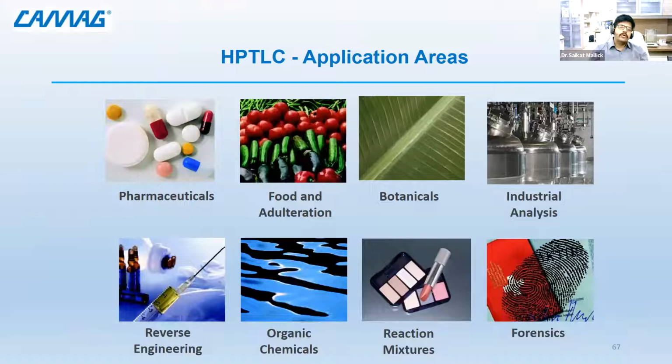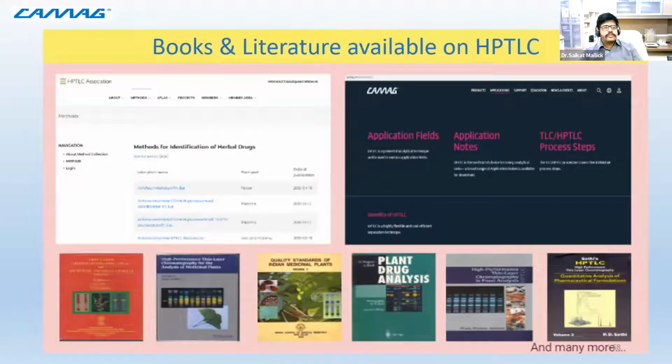Yeah, and because it is applicable to all fields, you can do a pharmaceutical investigation, a herbal investigation, food adulteration, food technology testing, and many other fields where HPTLC, with the same set of instruments, you can apply. Literature is quite there. I'll show you some other books also when we go into the demo part.